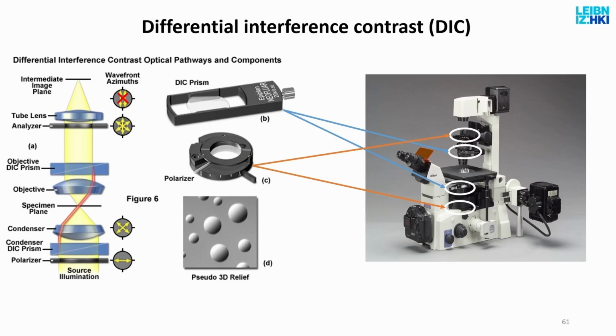You need two of these prisms. One of them is sitting right below the objective lens. So you can always tell, here's my microscope set up for that. If you look at the objective lens and directly underneath it, you will see this little thing sticking out from the lens. And then you use this screw to move the prism to maximize the 3D effect.